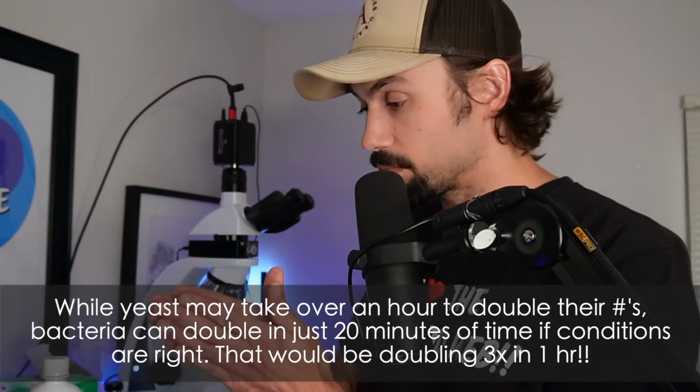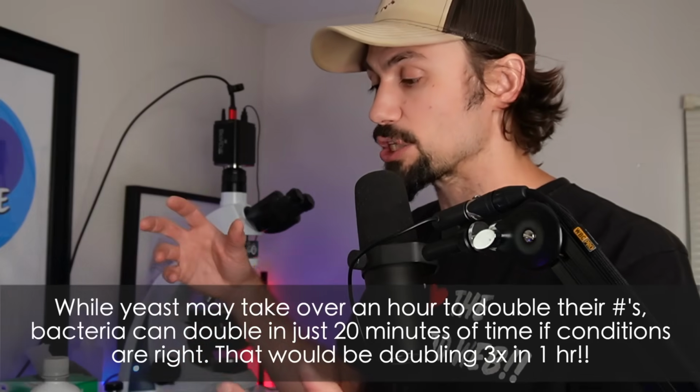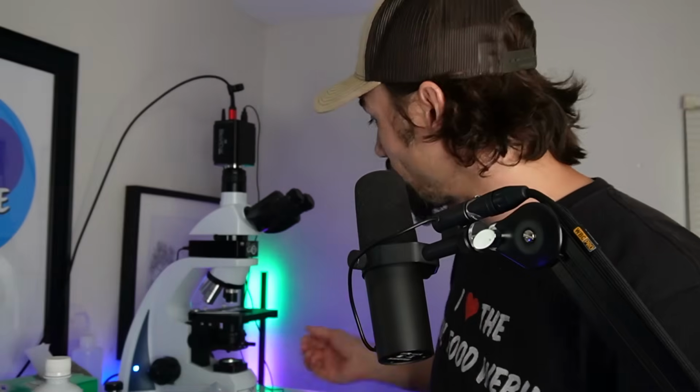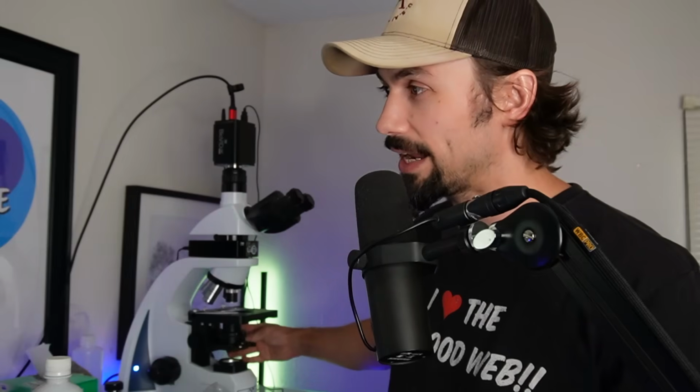Bacteria use up all the sugar, but at the same time their population just explodes. So these are ingredients that we know, ingredients that we're familiar with, and we can look at them right here together now, and I can show you what to look for. And it's not hard.